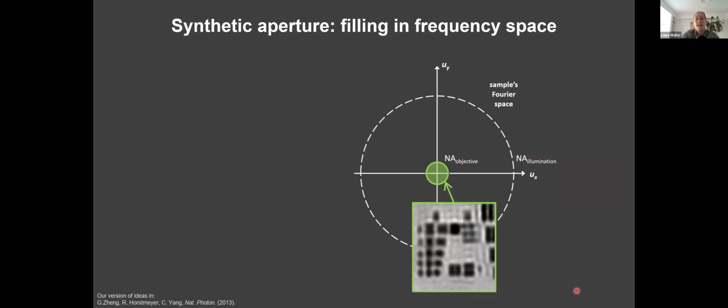Okay, so how does this work? I have to go to Fourier space. Some people probably are afraid of Fourier transforms. That's fine. It'll be quick. But basically, you look at the Fourier transform of the samples. This is the spectral information, spatial spectral information of the sample.